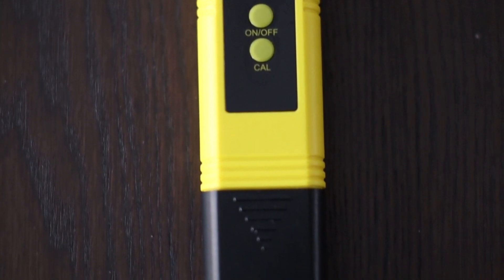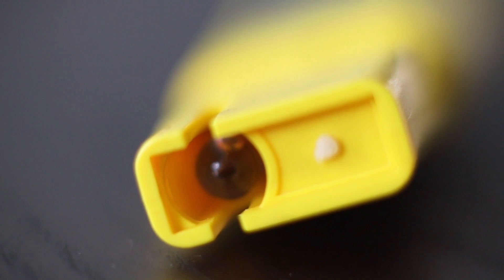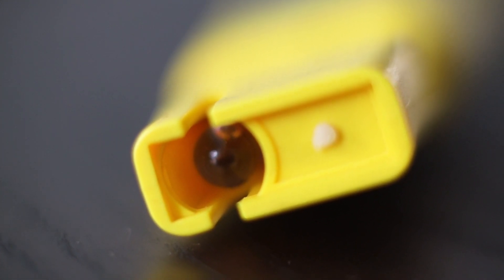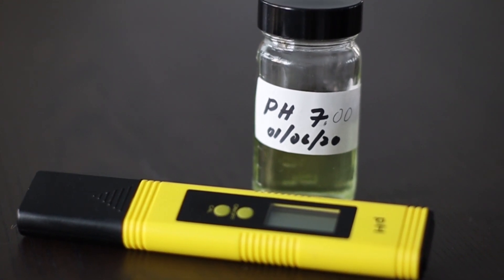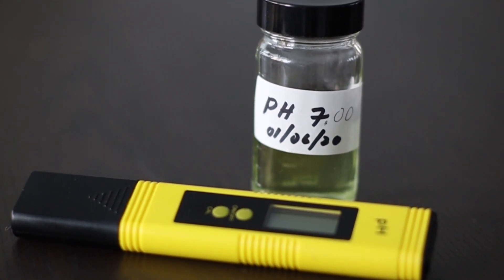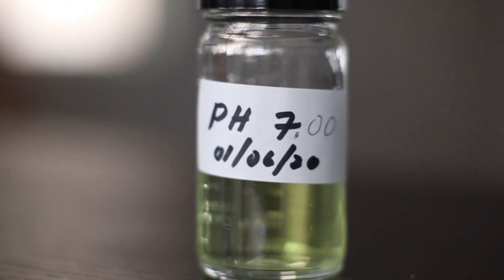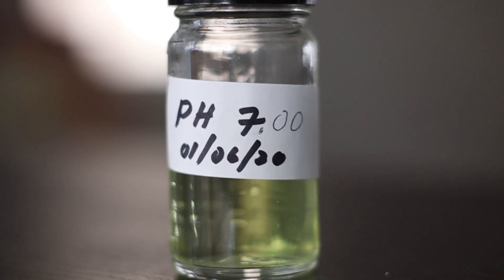I think this pH meter is still pretty useful for my purposes. I don't need it to be accurate to 0.01 — if I have it to one-tenth of a value, that's good enough for me. In the future, I'll test my pH meter against the pH standard to make sure I'm getting an accurate 7.0 reading each time, so I know if my meter needs to be recalibrated or replaced.